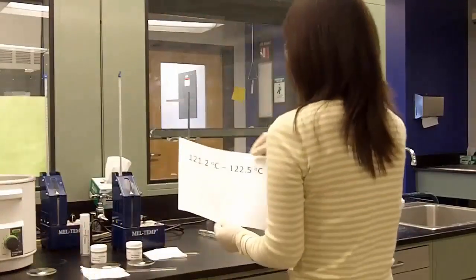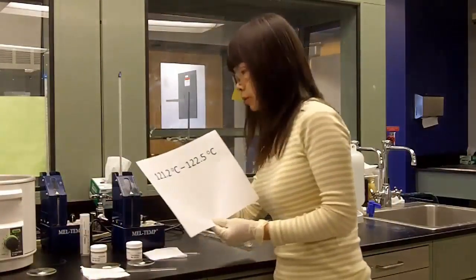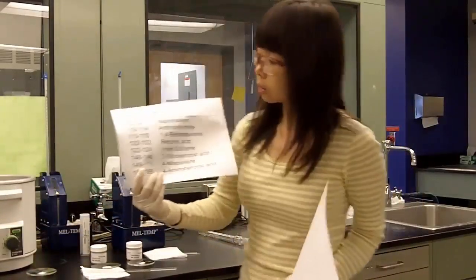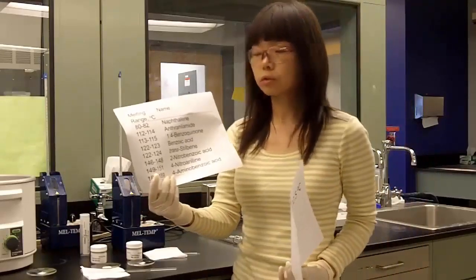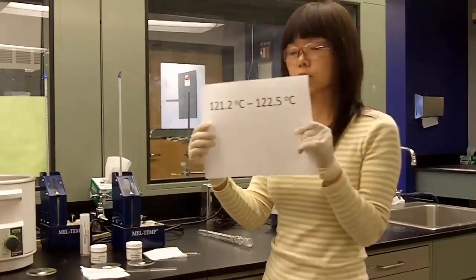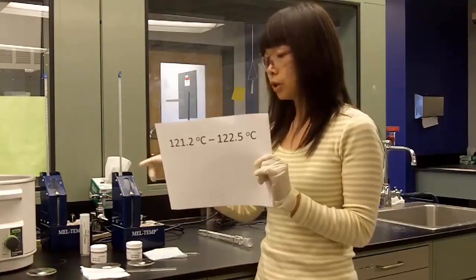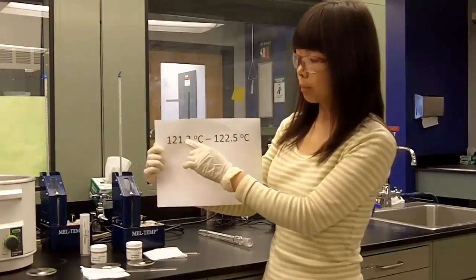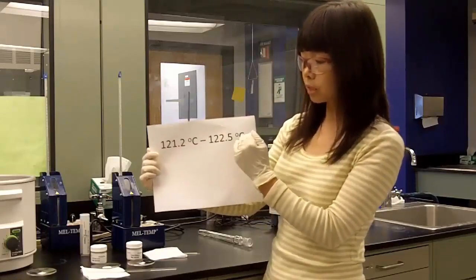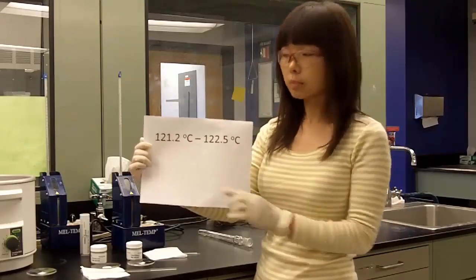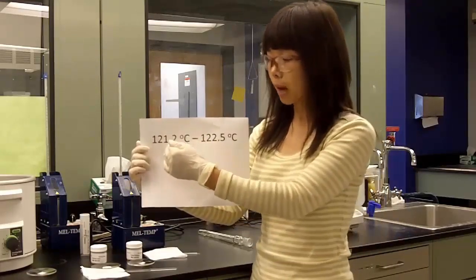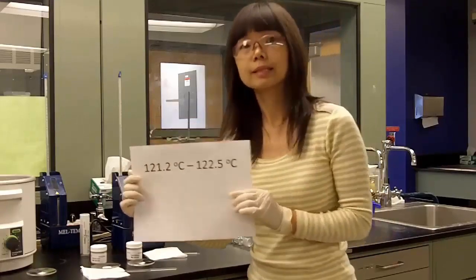One final thing we need to point out is the recording of the temperature. The chart given to you doesn't have decimal places, so this is just a rough idea. When you actually record your temperature, you need to pay attention to your significant figures. From the thermometer, you can record 121.2 degrees, that's the starting of your melting point, to 122.5 degrees, that is the ending of your melting point. Always make sure you have one digit after the decimal places and record the melting range of your observation.